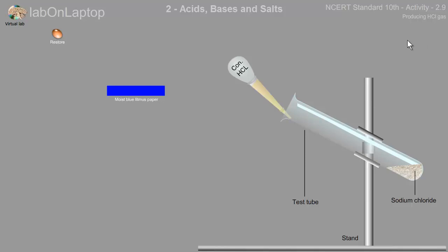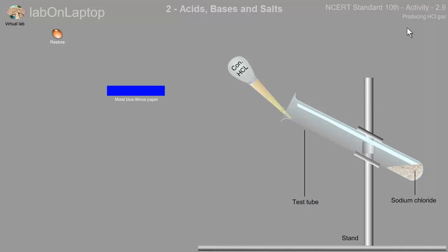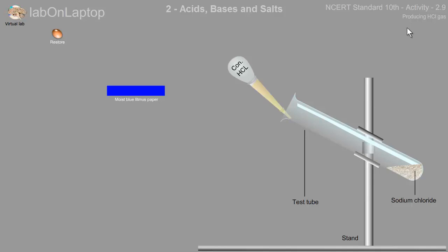Today we will see how HCL gas, hydrochloric gas, can be used. This is a little unique and odd because hydrochloric acid will be seen in the solution form, but hydrochloric gas can be used in which we can make it.